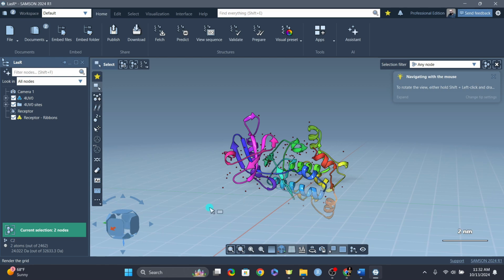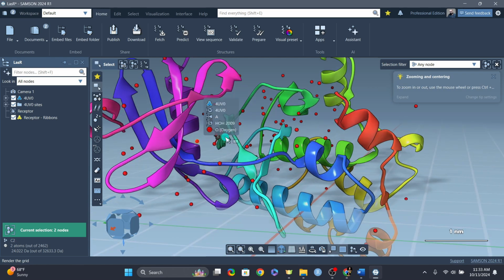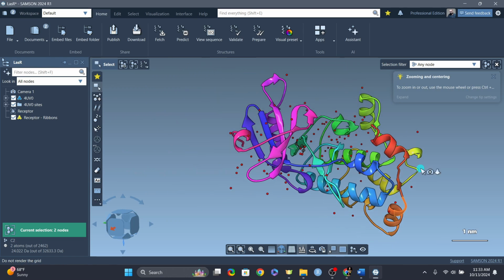So this tells you that this is the stable orientation. This is the right orientation, and then you can move along, because you will be watching a lot of structures. You will be watching ligand molecules, so you'll obviously move. If you're interested in that one, you can just keep it, or by clicking this, it will go away. It's up to you, right? And then there are other options. We will explore these options, but let's do something else with this particular protein.